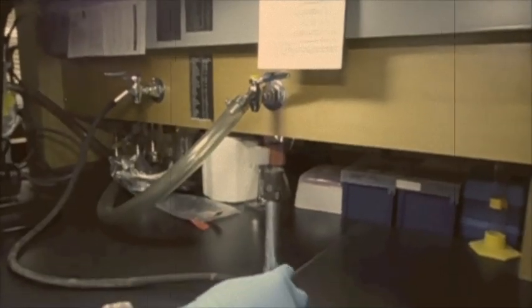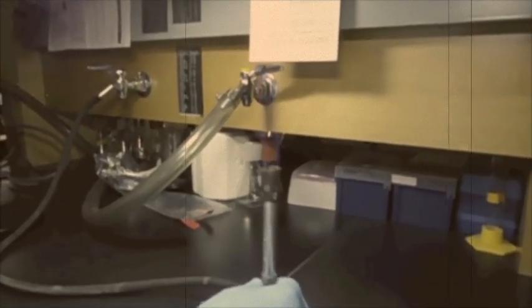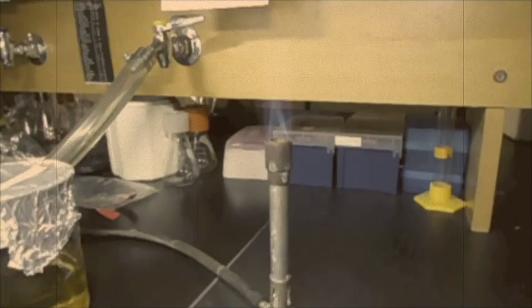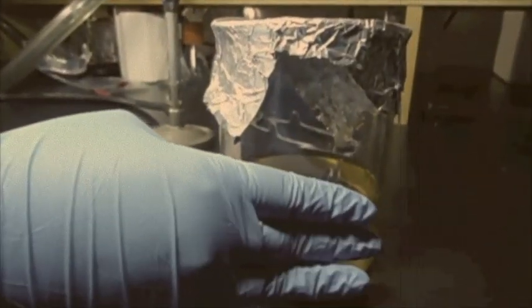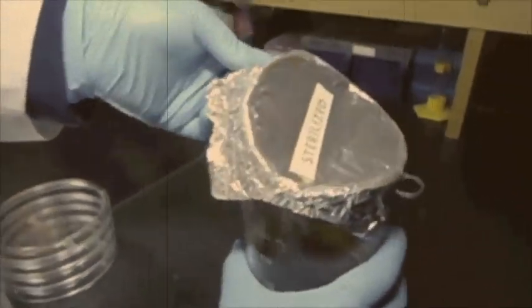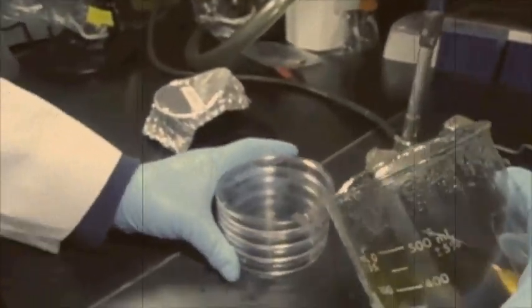Light your Bunsen burner in preparation for pouring plates. Remove sterile plates from your sleeve with lids attached. With the other hand, lift lid and quickly pour cooled agar solution into each plate.